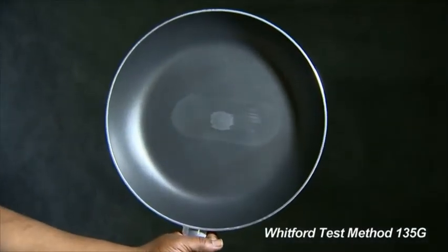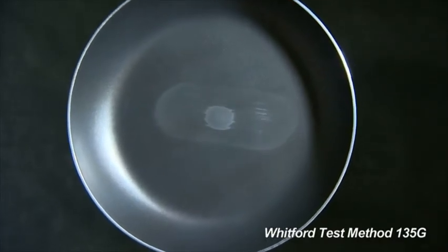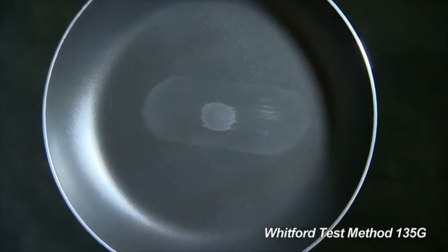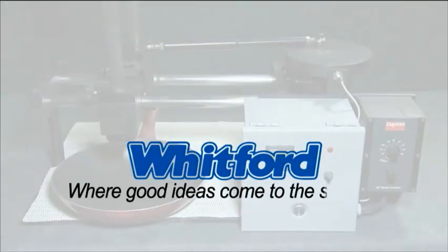Record the number of cycles, and we can compare the coating's performance against other coatings tested. The Reciprocating Abrasion Test, from Whitford, where good ideas come to the surface.